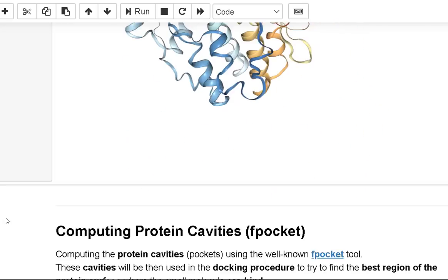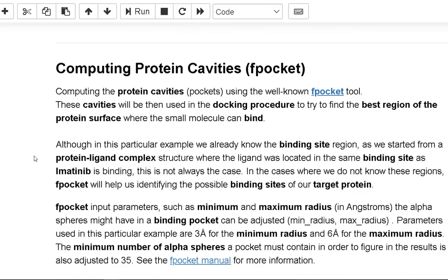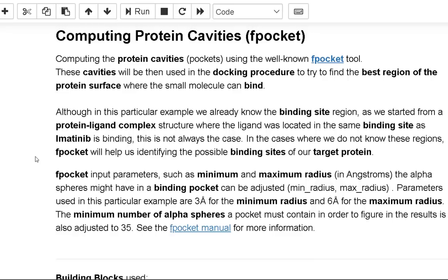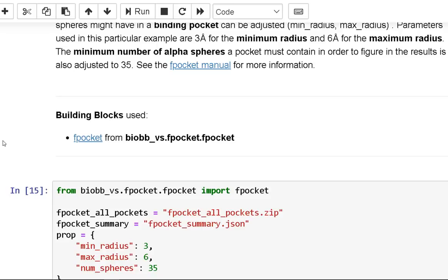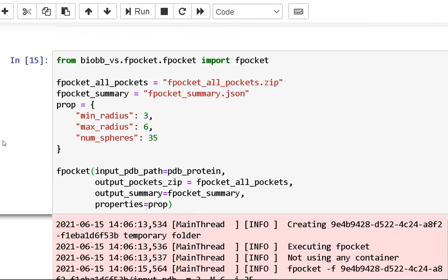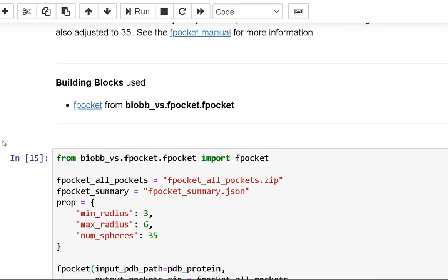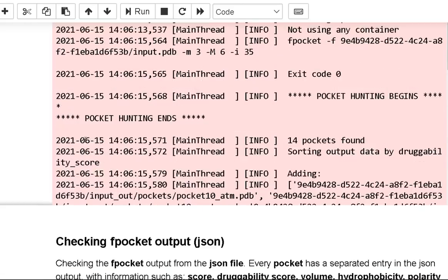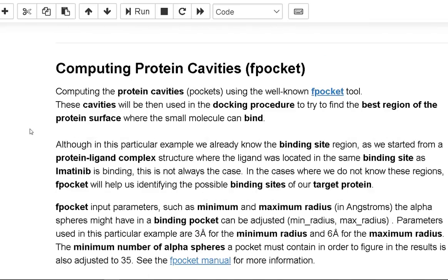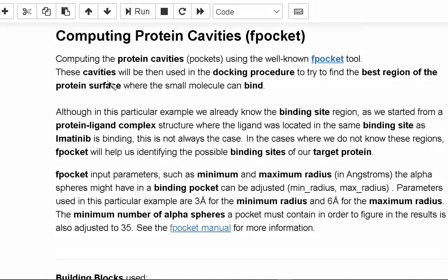The next step is to use the FPocket tool to compute the protein cavities. The docking algorithm will then use these cavities to find the best region of the protein surface where the small molecule can bind. We already know the binding site region in this case from the protein-ligand complex structure. However, this is not always the case.